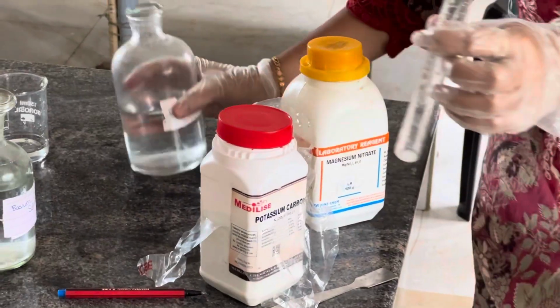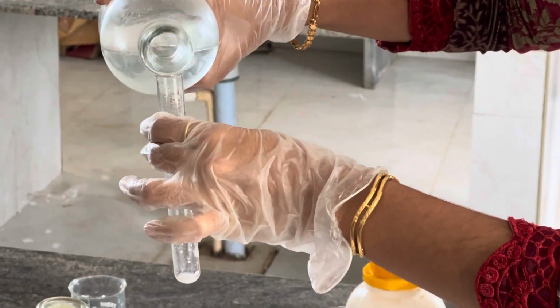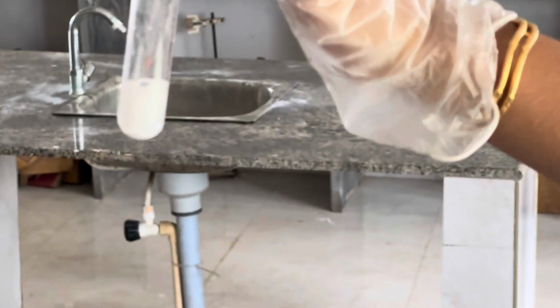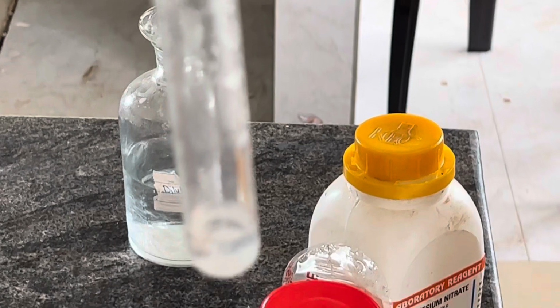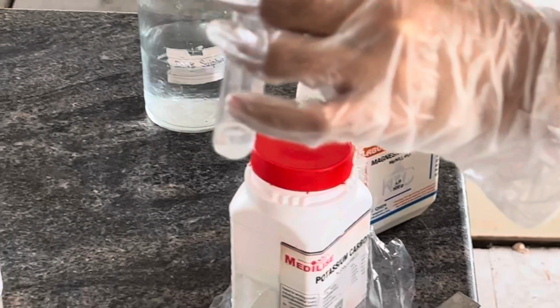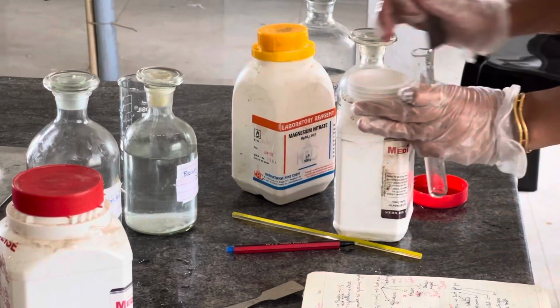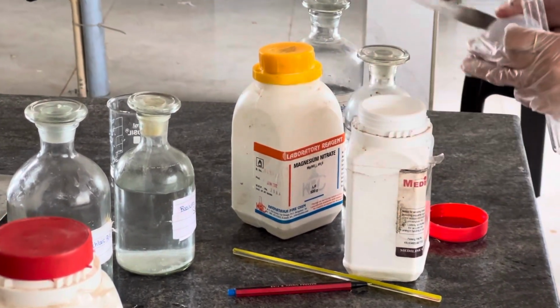So when we add dilute sulfuric acid to the salt, we get brisk effervescence. See the reaction, you can see the brisk effervescence, right? Brisk effervescence means a gas is evolved, the evolution of carbon dioxide. You can see the bubbles of gas, that is carbon dioxide gas, and the anion present is carbonate. So here we got an idea. By this test we get an idea that the salt present is carbonate, and you have to go on for the confirmatory test for carbonate. I will put a separate video on that.